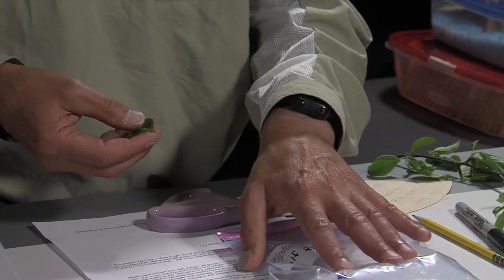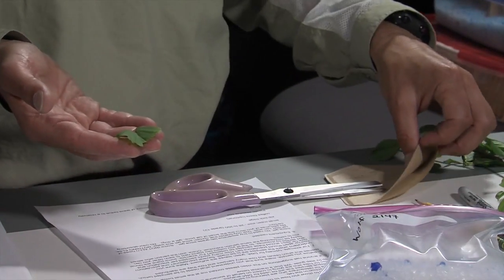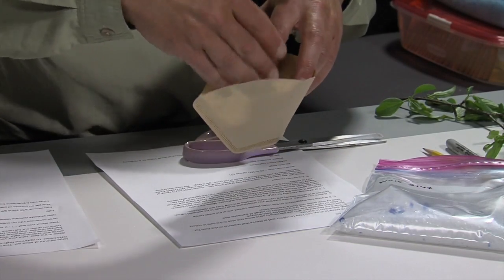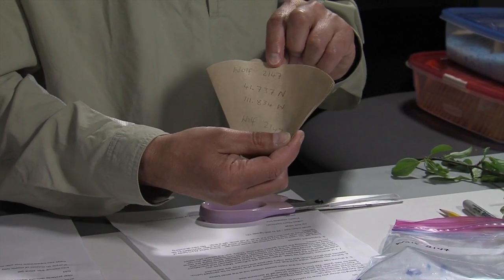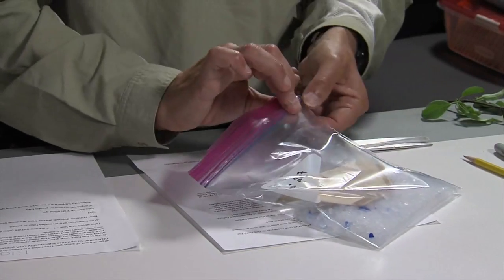And you can, for some plants, especially if you've got a very robust leaf like this, put it directly into the silica gel. Often we're working with fairly delicate material that, once it's dried out and it starts rubbing against the silica gel, the leaf starts to disintegrate, and getting the pieces can be difficult. So we can protect them by putting the leaf into some absorbent paper, like a coffee filter. And on that coffee filter, you can see I've written the identifying information, a unique combination of my name and the collection number. That should be sufficient, but just to be sure, I've also put the latitude and longitude, and the date would be a good idea as well. So then we fold that coffee filter over just to keep that leaf from coming out, and we place that inside the bag. And that's really all there is to it.